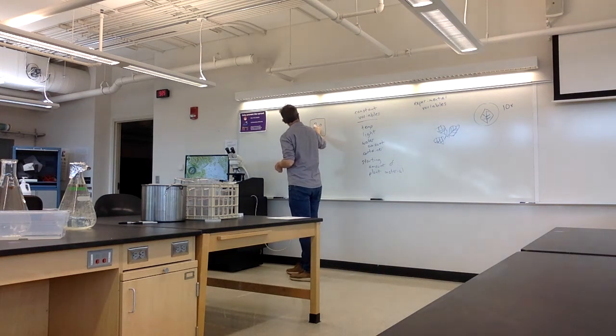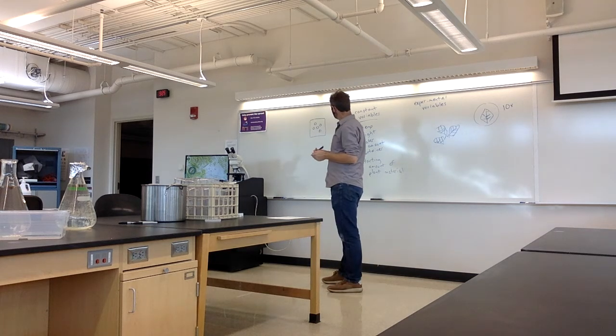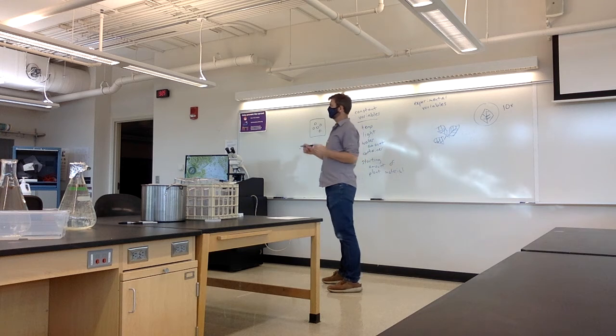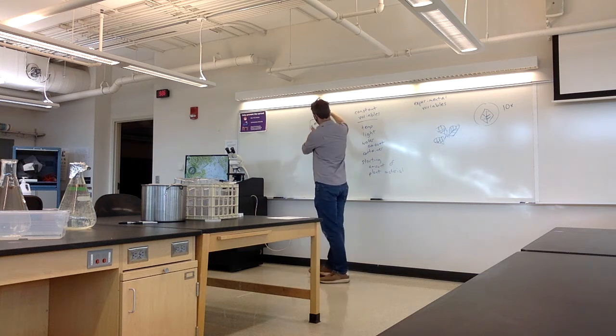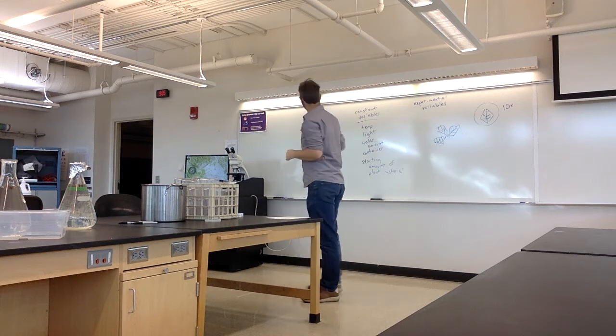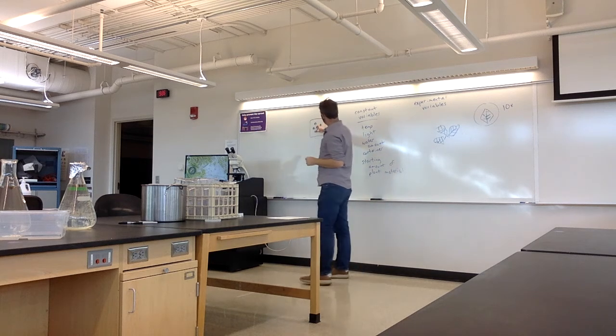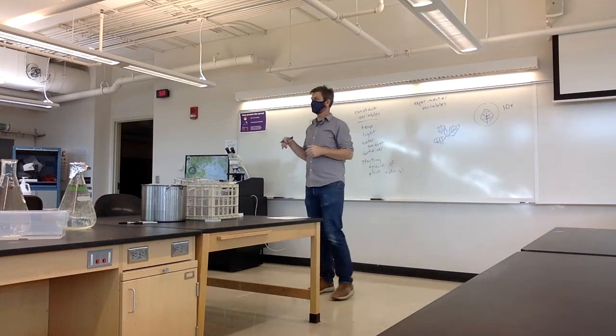those little puppies on there, and we can take photos of them. And it's possible to use image analysis software, and you can just take the photo, maybe against a white background, and you can take this photo and standardize it to the square of what you see from directly above, and measure how many of the pixels in that photograph are black or green or whatever.